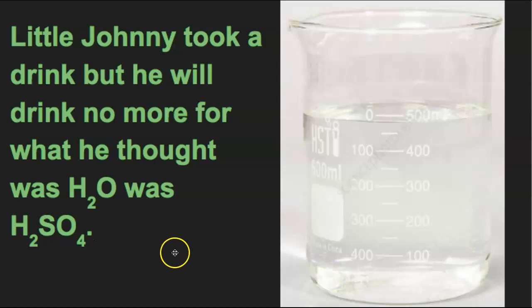So the moral of this statement is, even though you think you know what it is, you need to be careful. And the other thing is, never ever eat or drink out of lab glassware. It's not safe. Even though you wash it, even though I wash it, there still could be some remaining contaminants that can cause you problems.